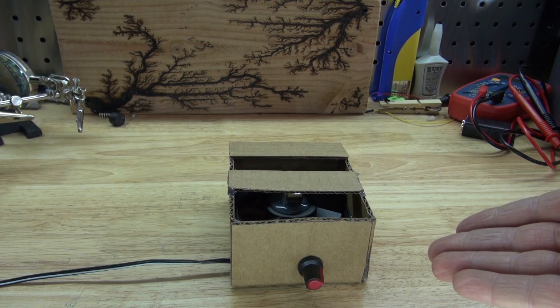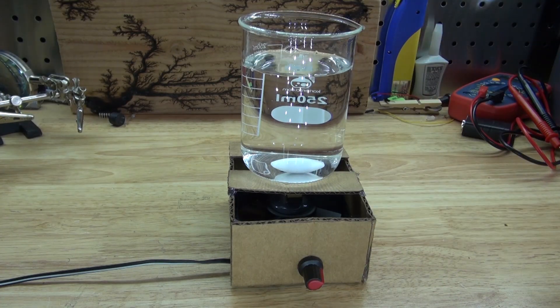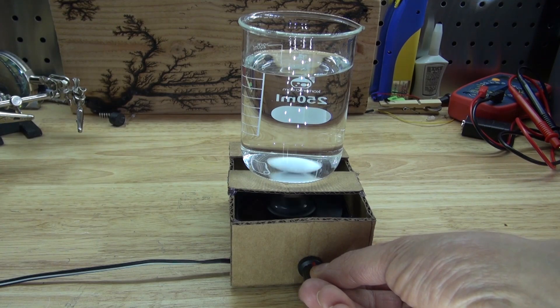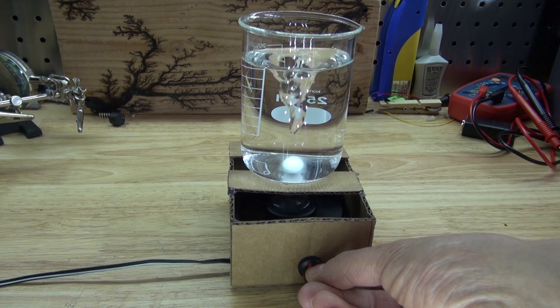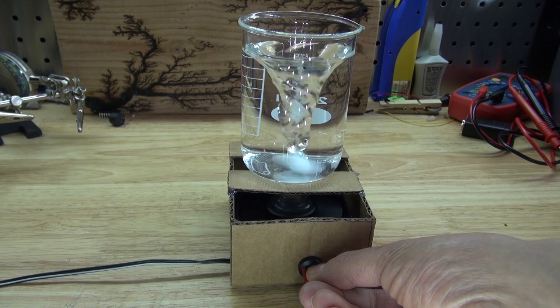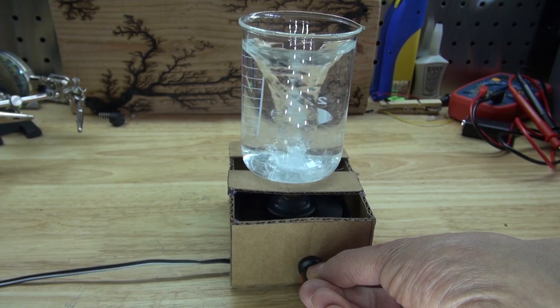Let's go ahead and test it out. I have a beaker of water and my stir bar. Let's test it out. Success!